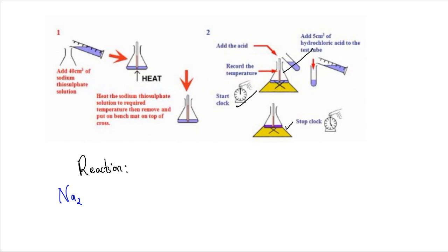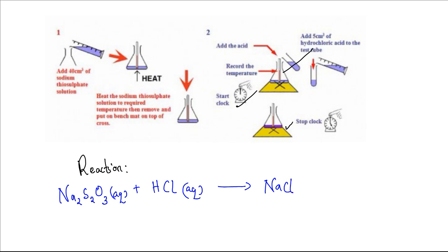Sodium thiosulfate plus hydrochloric acid leads to formation of sodium chloride, water, sulfur, and sulfur dioxide gas.